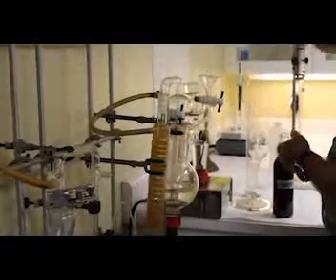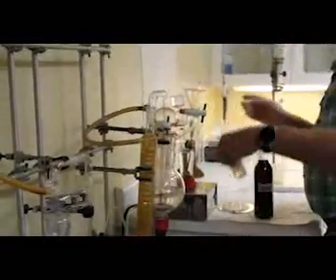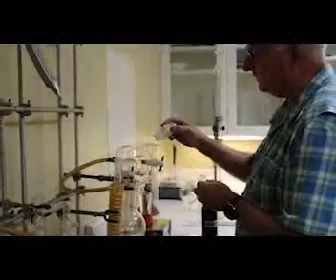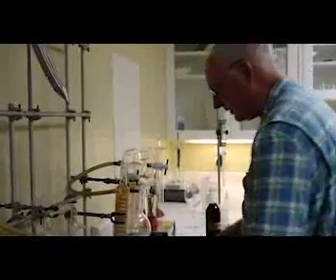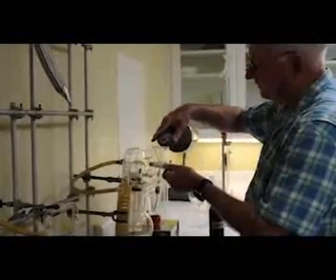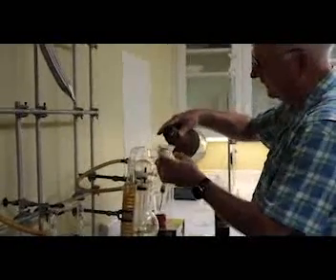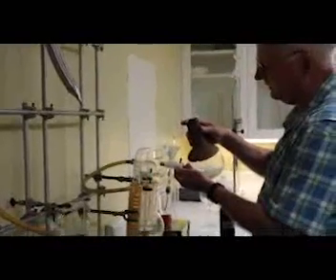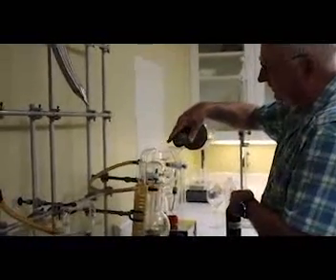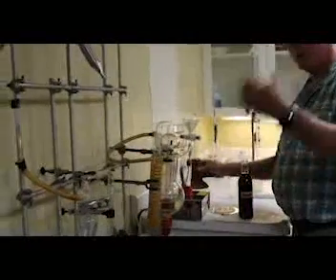Then we're going to add just a touch of 0.3% hydrogen peroxide. That neutralizes any of the acidity from the free SO2 in the wine, so it doesn't mess up your reading. And we're going to add water from one of these funnels here, which is full of water. And we close it up, and we'll fill the funnel up again, and we'll use that to rinse, because we're normally running a whole bunch of these at once.